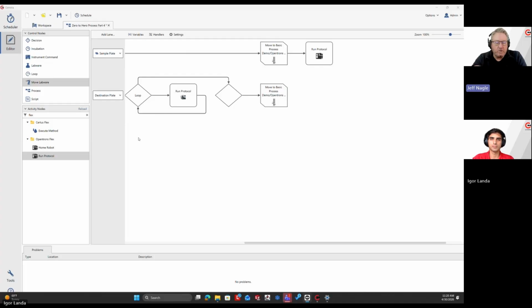But what we're about to show is you can connect both lanes through what we call linking. The reason you'd want to do this is because you don't want your sample plate to go and get liquid out of it when the destination isn't even there yet. Maybe you have a leaky tip or the precious liquid is falling onto the other deck. That's a possibility. And you just don't want one labware not to be there or your Opentrons to be moving when another plate is coming in.